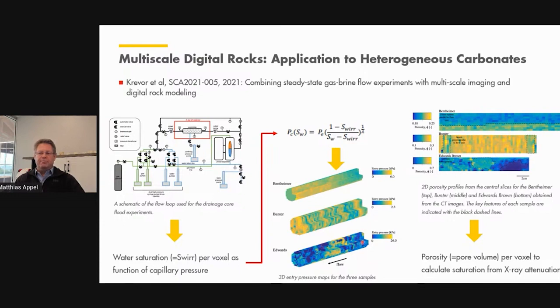Because if the capillary pressure of the CO2-brine system exceeds the entry pressure into a certain pore, then one can assume that the CO2 will enter that pore. It's kind of a logical thing there. But that is a very neat indication, in my opinion, where the scanning at different length scales results in a workflow for digitally describing the pore-scale dynamic processes.